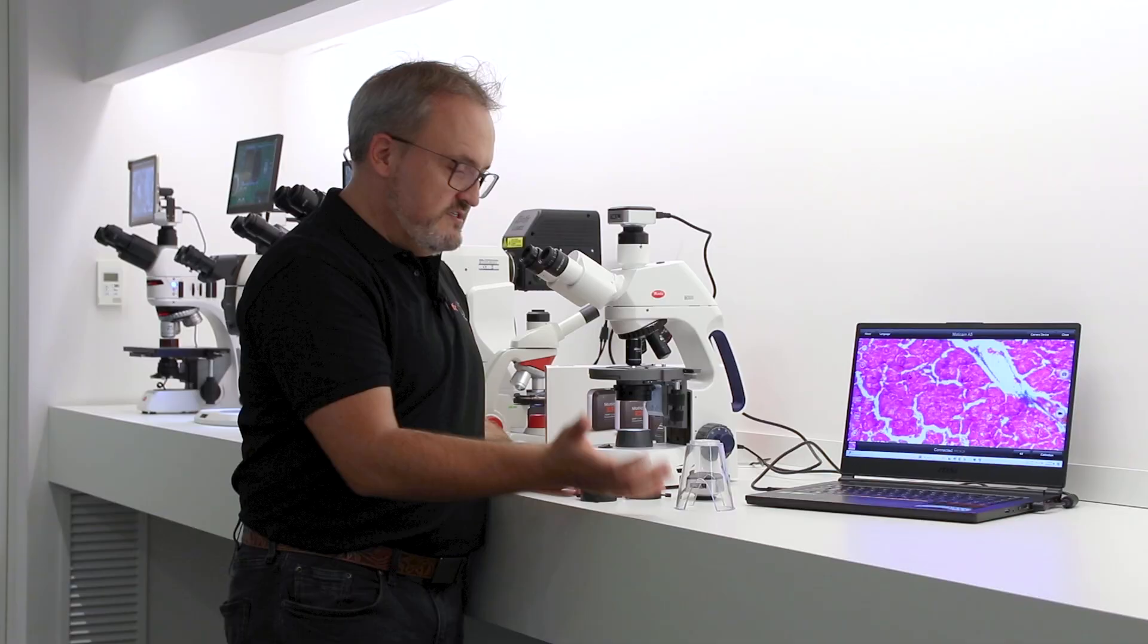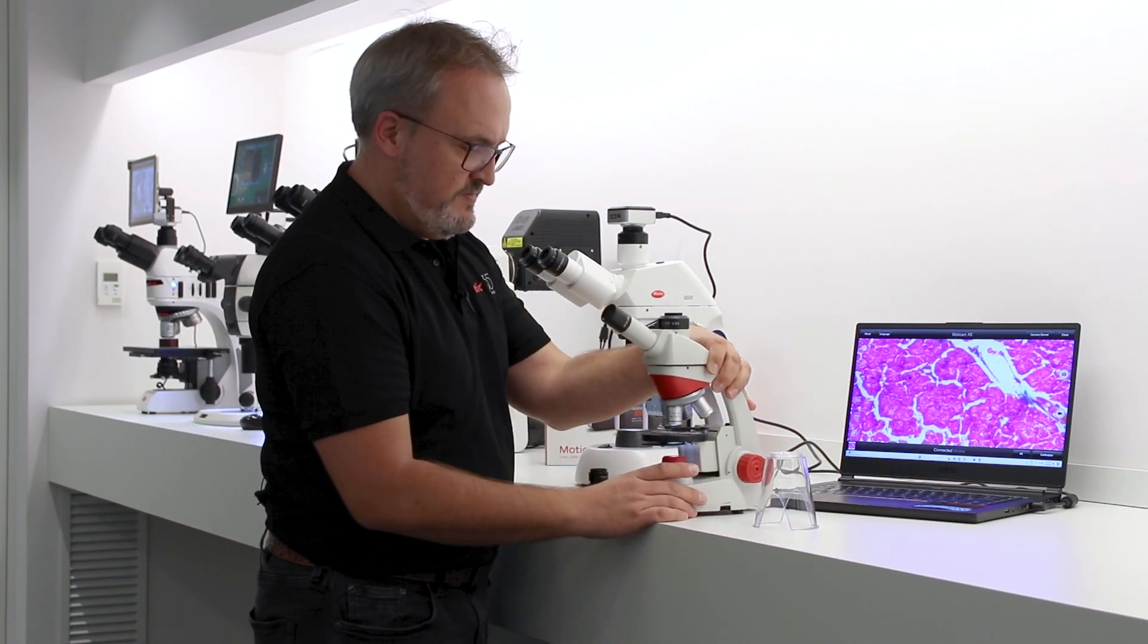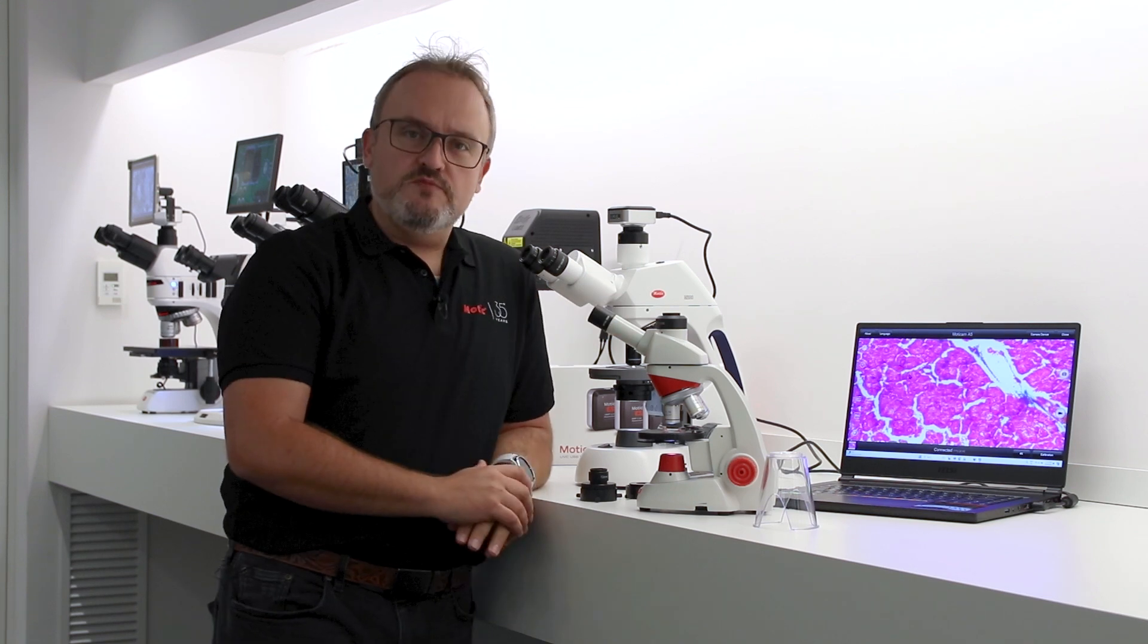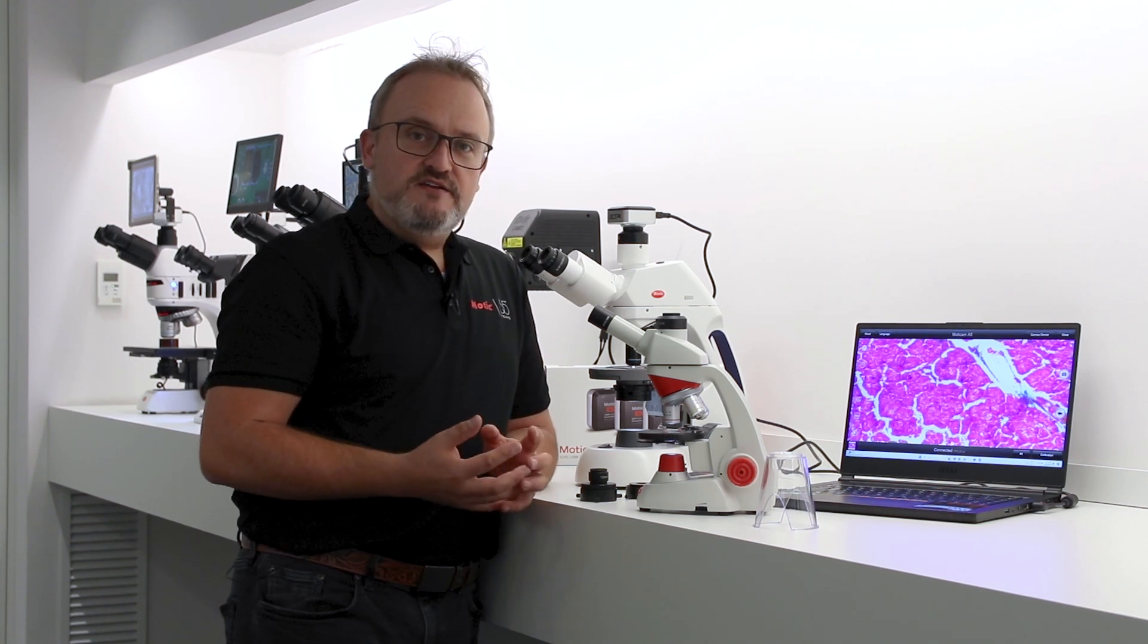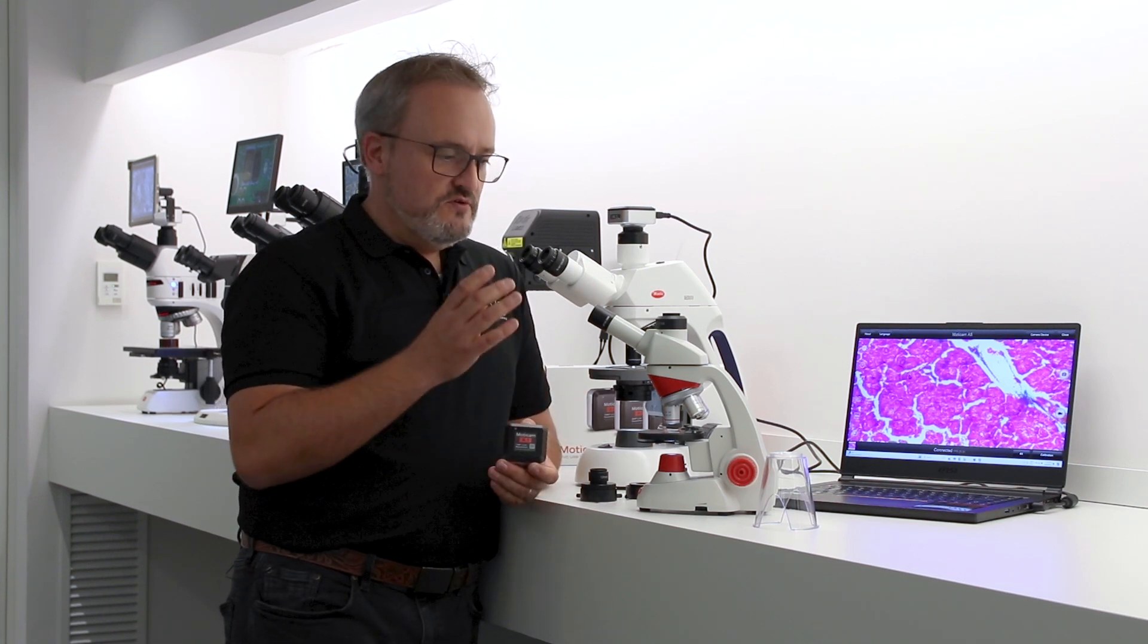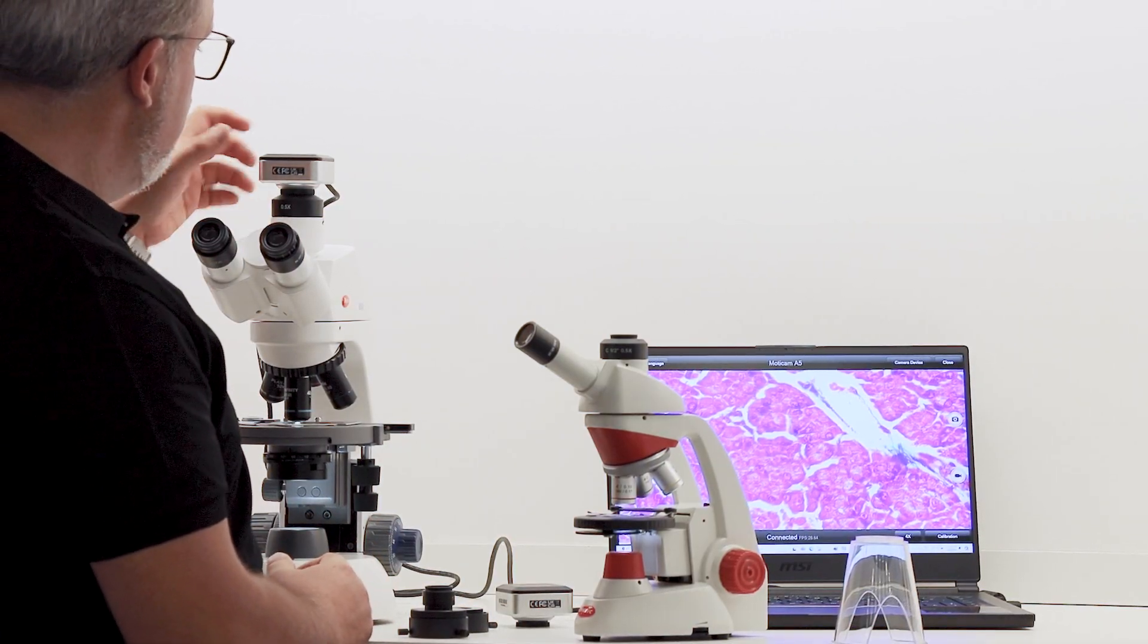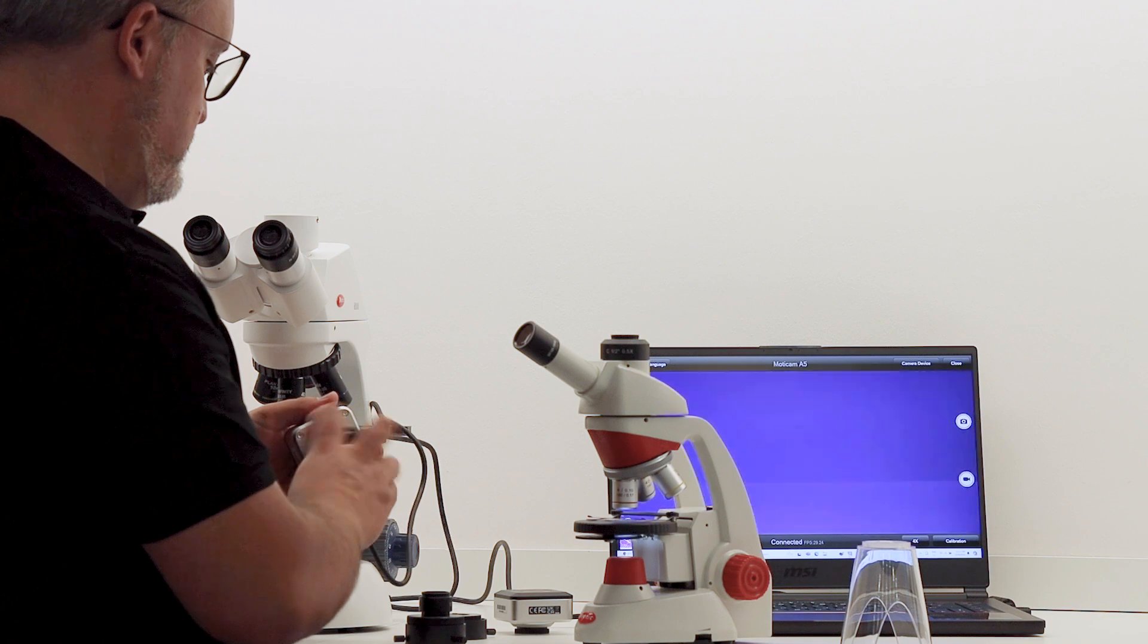But if you have a monocular microscope, imagine you don't have a trinocular, you don't want to change your microscope, you want to turn this into a digital microscope. The MOTICAM A-Line is priced at a point where even the entry line A1 makes it very affordable to upgrade virtually any microscope, even a monocular microscope, into a digital microscope. Just now I have this one on a trinocular, so if I take the camera away from the trinocular, I take away the c-mount adapter which is specific to a microscope.